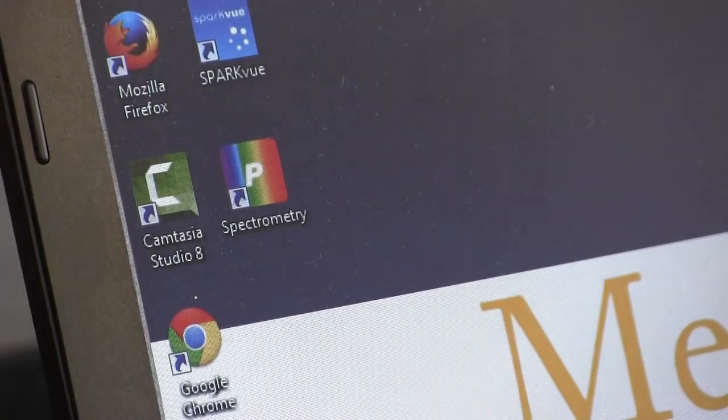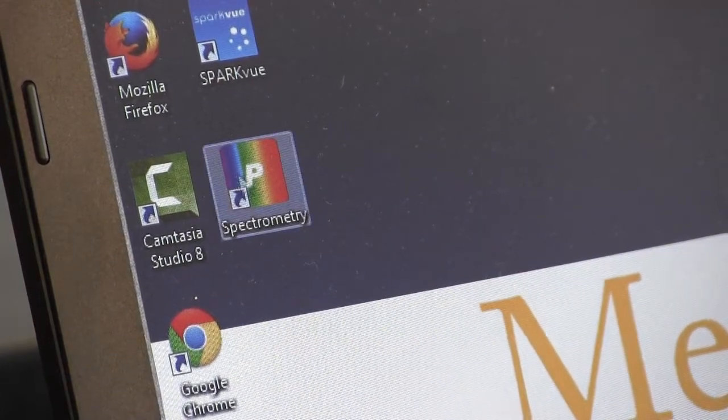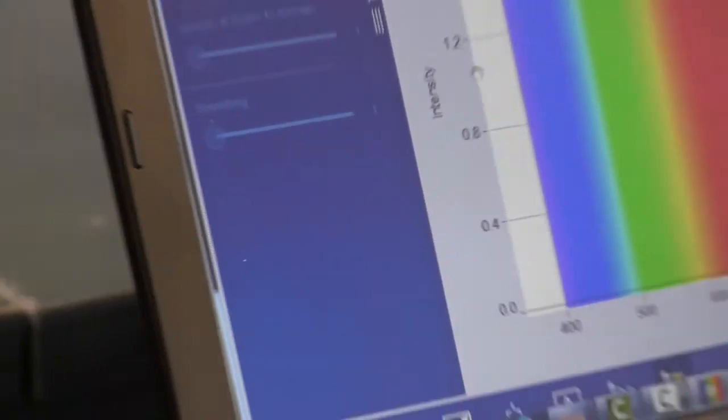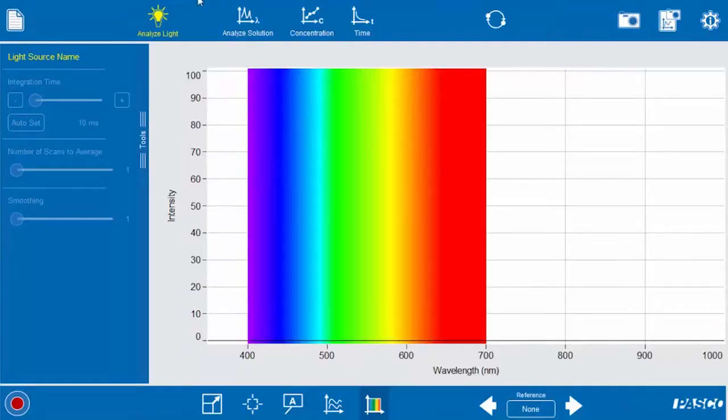After your spectrometer is plugged into your computer or attached to your iPad, you will launch the spectrometry software. Because we're going to be analyzing light, you want to make sure this yellow button that says analyze light is illuminated, and then you take the other end of the probe and point it at a light source.